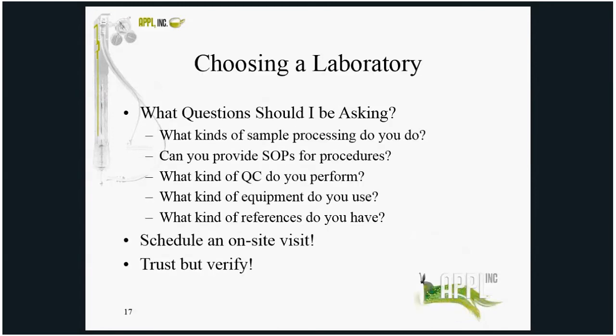The lab can be a good resource for you too. Ask them questions. They can help you determine the type of sample processing you need for your analytes. Ask them for their standard operating procedures and read it. Ask them what type of QC they perform and how frequently. And ask for references that relate to your project. And it's always a good time, when budgets and time allow, to schedule an on-site visit to trust but verify.